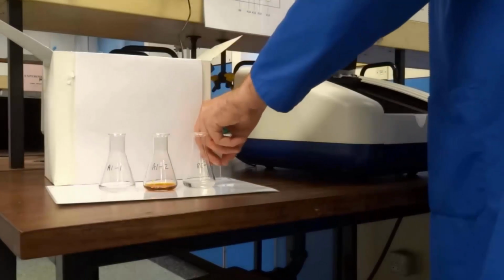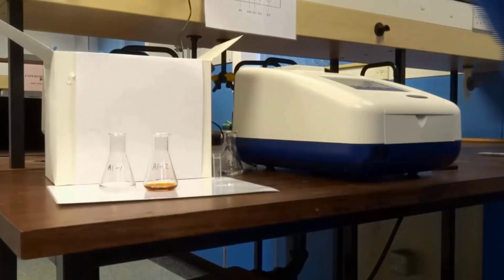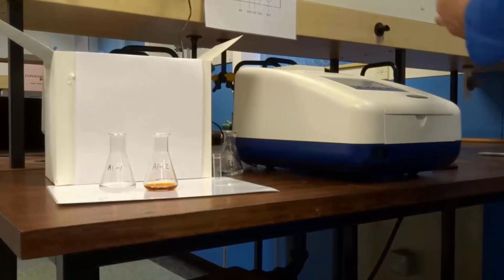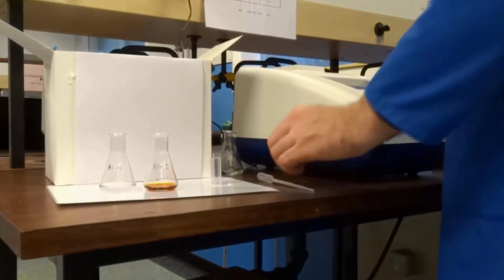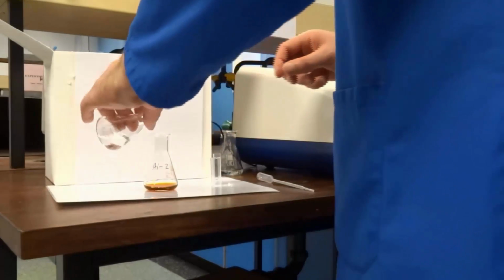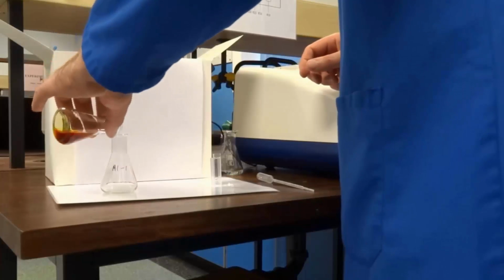Then I can remove that, and I'm ready now to set up for my experiment. So I get a clean cuvette and get my pipette ready to transfer my mixed solution. Once I mix the solution, the reaction starts, so we need to work efficiently. I pour one of the reagents into the other and then pour it back into the first glass so we get good mixing.